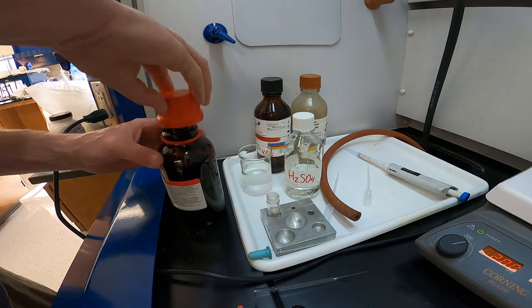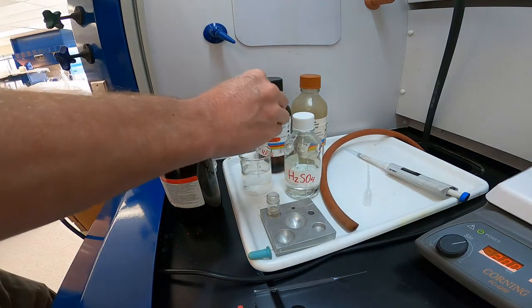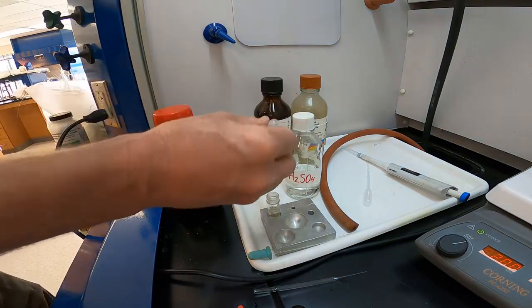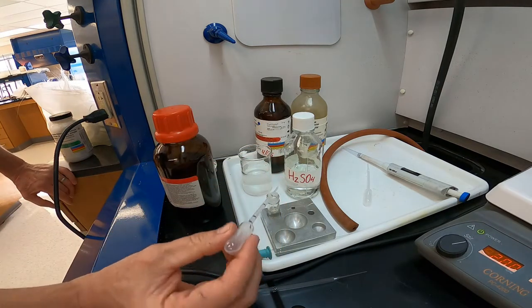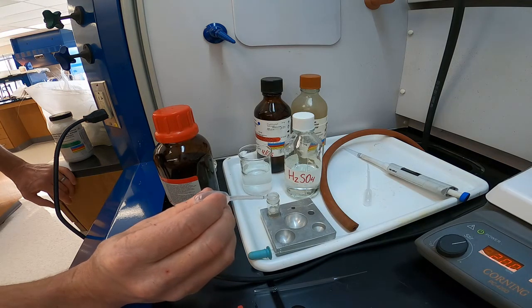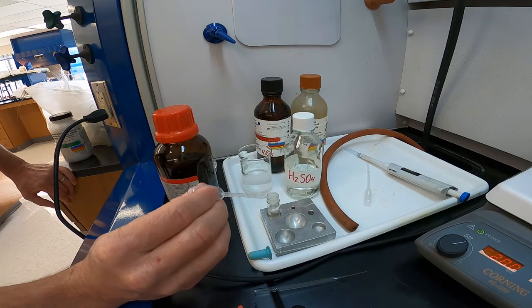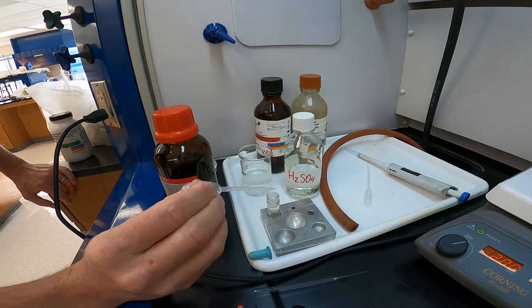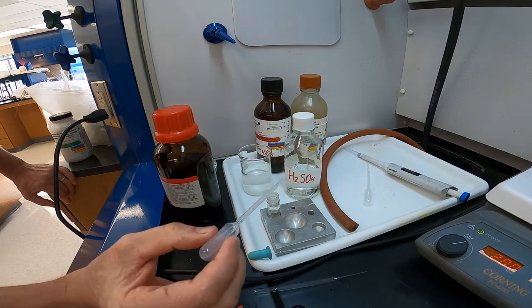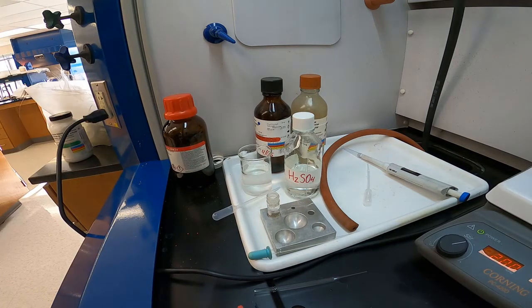And then we'll add a few milliliters of our sodium bicarbonate solution. And what you should see is some fizzing, a little fizzing at the bottom there. It's okay to add more. So let that sit for a few seconds while I get the glassware ready for the next part. In the next part, we're going to transfer the product material to a new 3 milliliter conical vial.